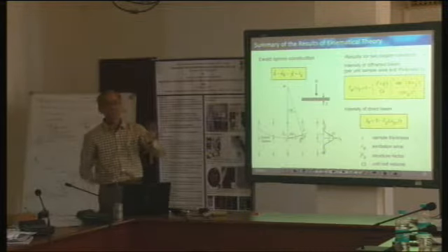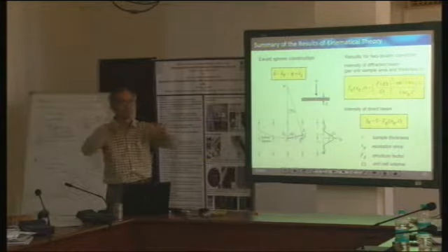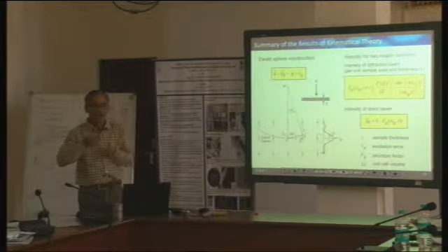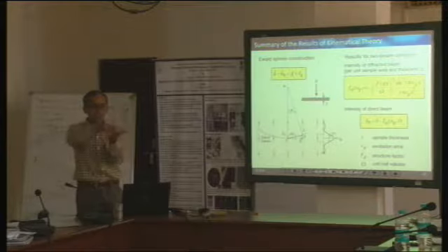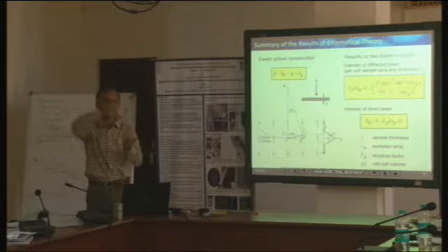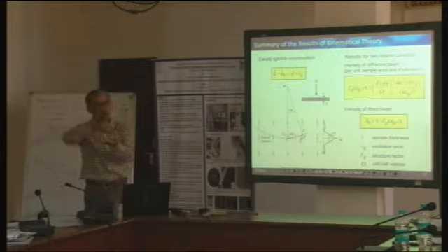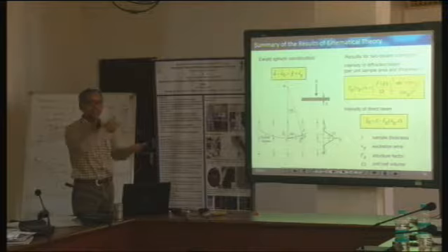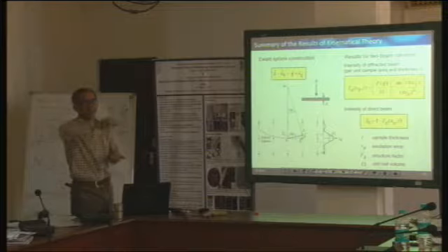But let us assume that somehow I have found a material which, even after making it thin, doesn't become bent. So the bending contour is ruled out. And let us assume that I have explained how to prepare TEM samples in a conventional manner, in which case we always end up getting a wedge-shaped sample. When we have that sample, we create a hole in the center using an ion beam. At the boundary of the hole, it is very thin, but as we go away, it starts to become thicker and thicker. So effectively, we get a wedge which is circularly symmetric.